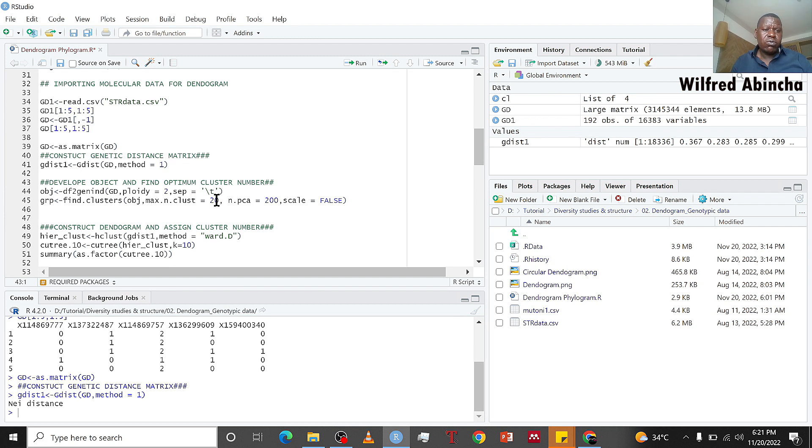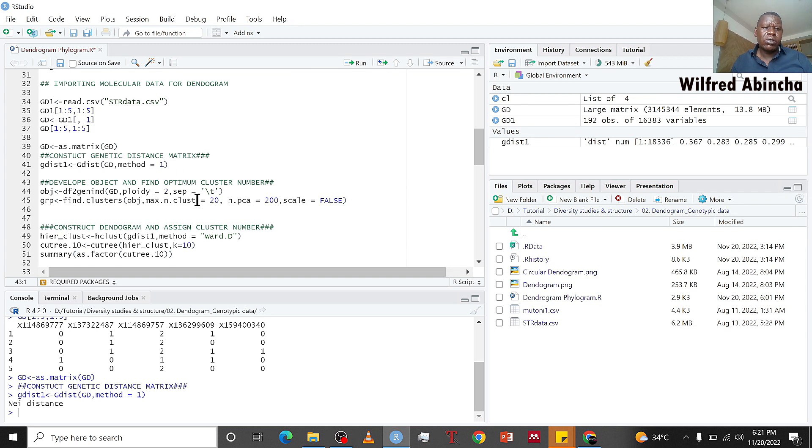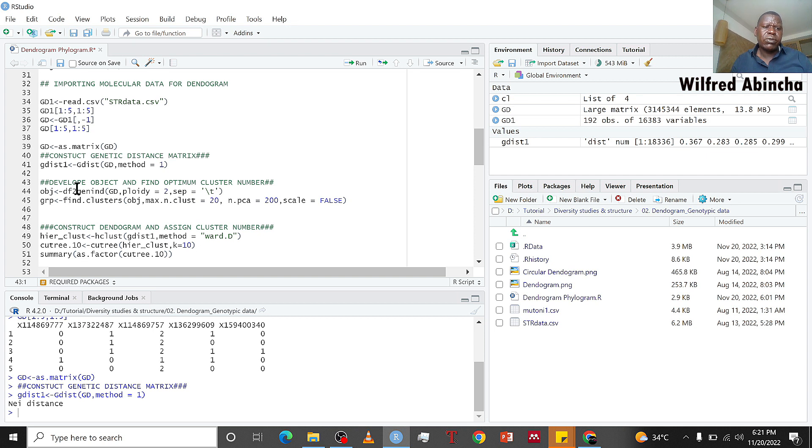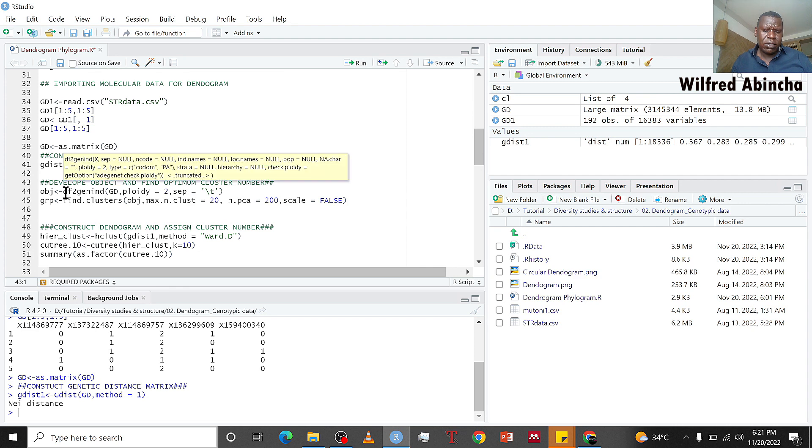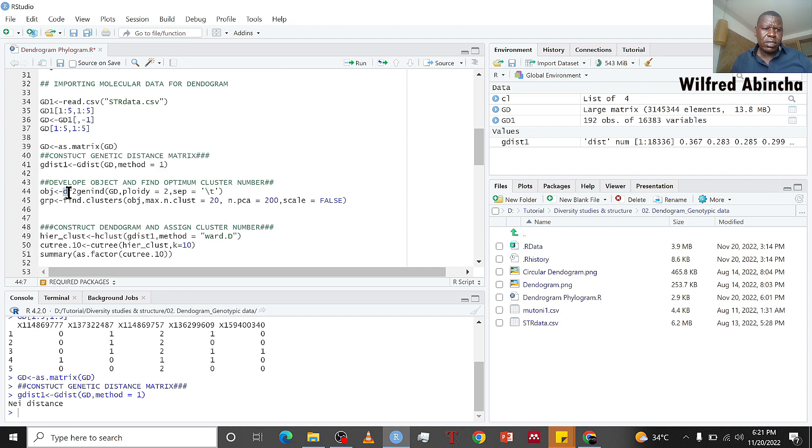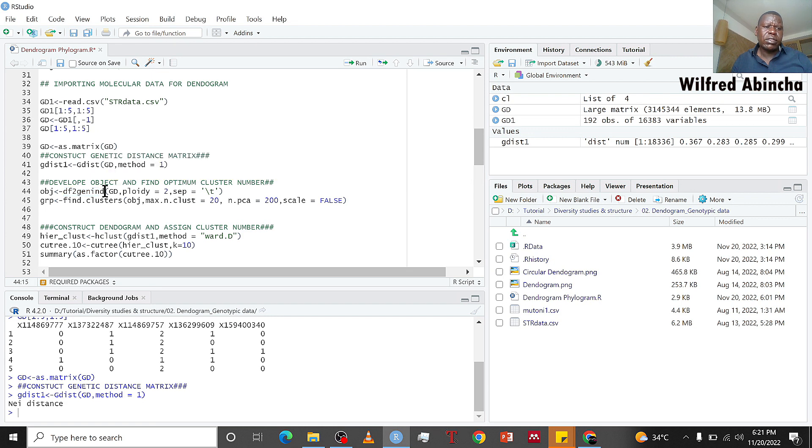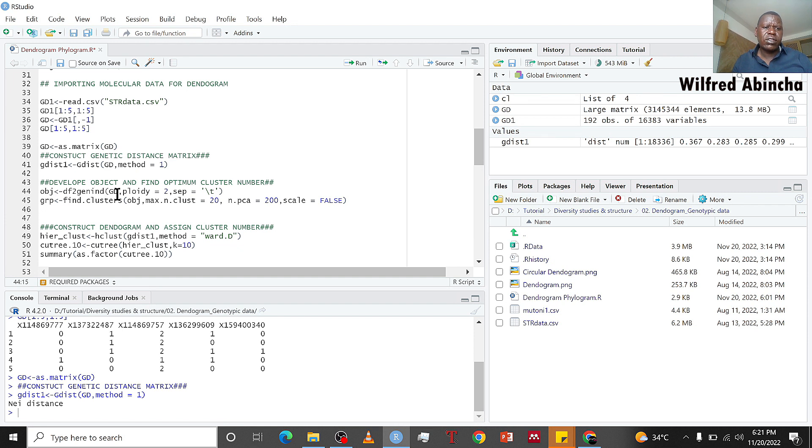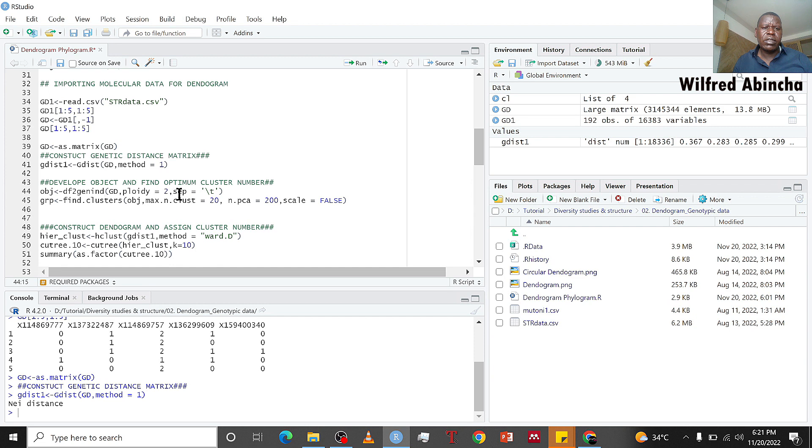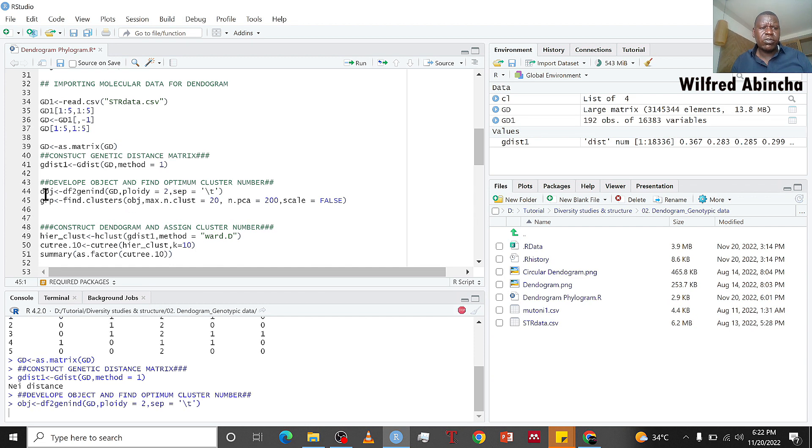Now the next thing is to know the optimum number of clusters which we may be willing to work on. We use the df2genind function to create an object and call it obj.